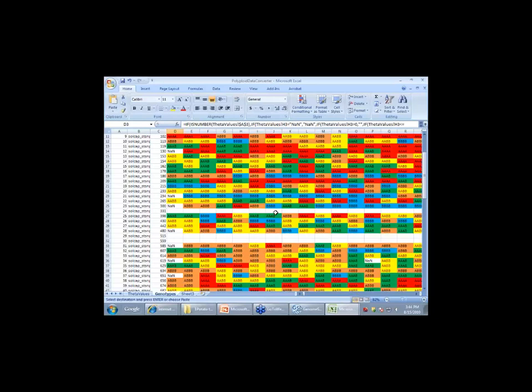Like I said at the beginning, we're working with Illumina. We've provided Illumina with this data and the clustering, and they're developing the Polyploid data software so they can capture this data right from them. And you'll be able to export it right from the Genome Studio software. They hope to really have this in a couple months. So about the same time you should be getting your array data from the Infinium chip. We should be capturing that.